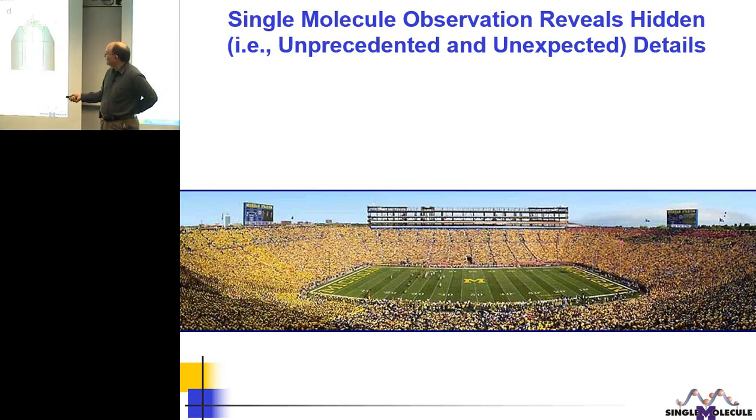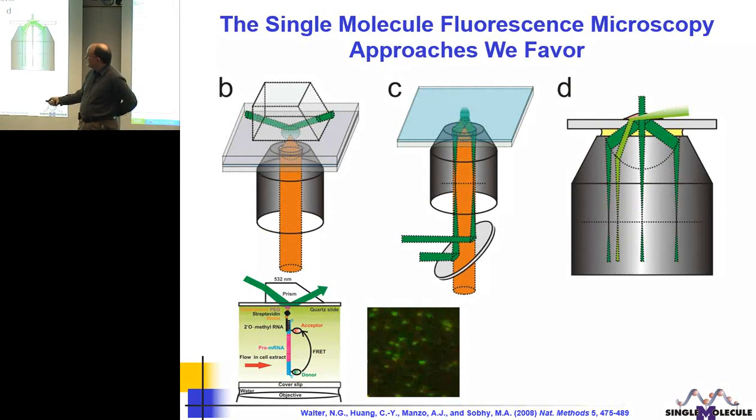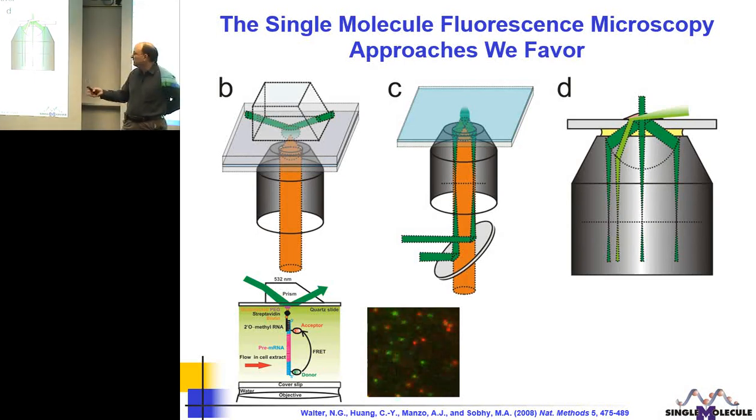In the case of FRET here, where we have immobilized molecules on the surface in an isolated fashion, either in just pure buffer or in a cell extract or something, of course, there's also the concern, but again, we are typically limited by photobleaching. And here, I mean, lifetime maybe half a minute, a few minutes or so. But we believe that over that period of time, the relatively low intensity that we use with the evanescent field here is not hurting very much the molecule. But I mean, you have to do controls to make sure that it checks out.